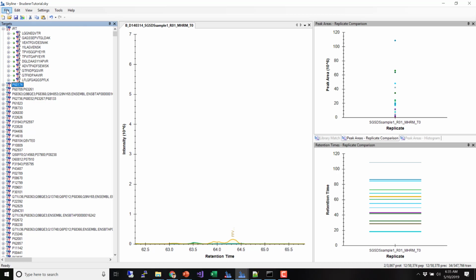We save it, but before we do that, I'm going to have us open up one file so that we make sure everybody is on the same page for having the annotations and the report template that we need. Our goal is to get some data to Mina so that we can run MS Stats and see what that's like. So we're trying to get through the processing workflow we've described, which is defining targets, importing data, running mProphet, and then exporting a report.